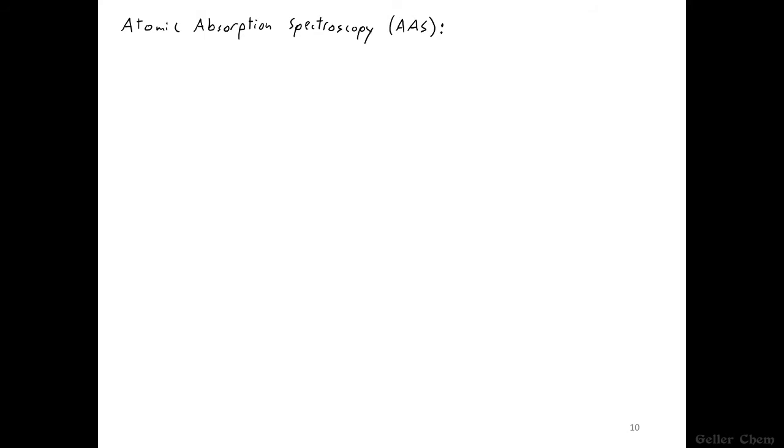So here's how we're going to write that. Measure trans/absorbance of hollow cathode lamp light.